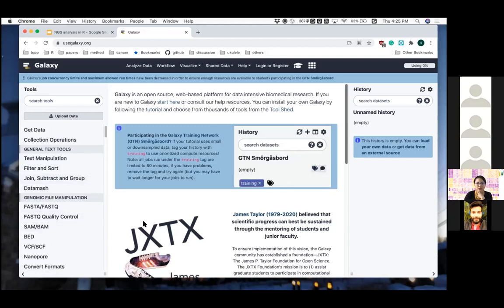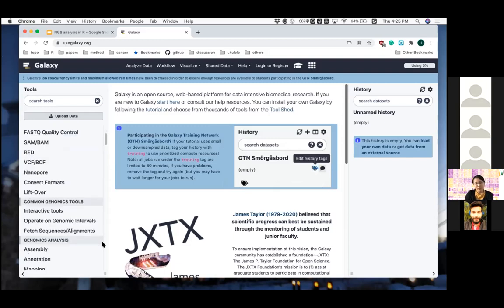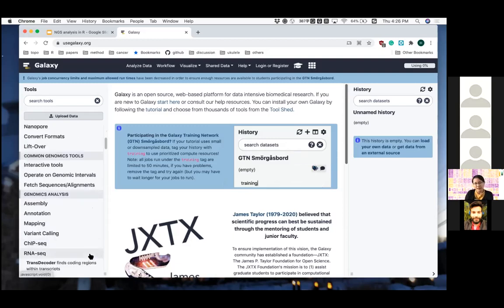However, this provides you a very excellent platform where it is also cloud-based, so you don't have to worry about the computing power of your own laptop. You could do very heavy computing on here. So if you don't have the resources, you don't have a powerful enough laptop, or you don't have enough coding skills to put together your pipeline programmatically, this is a very excellent resource. And also sometimes you just want to do one simple analysis and you don't want to have to go into the trouble of installing the tools. This is also a great resource.